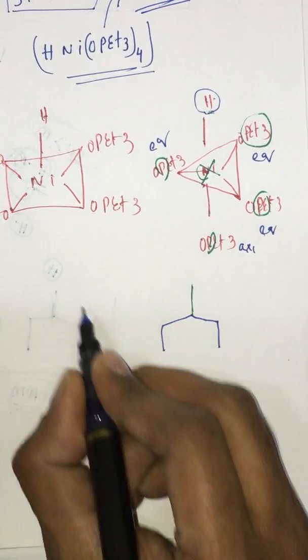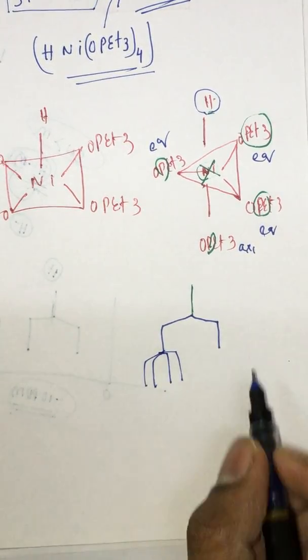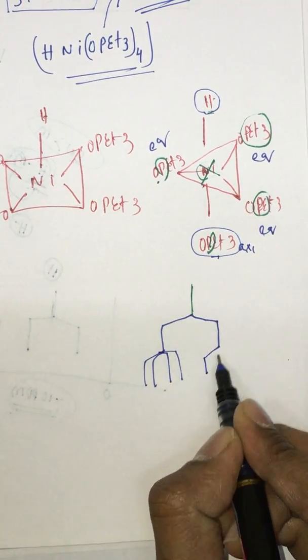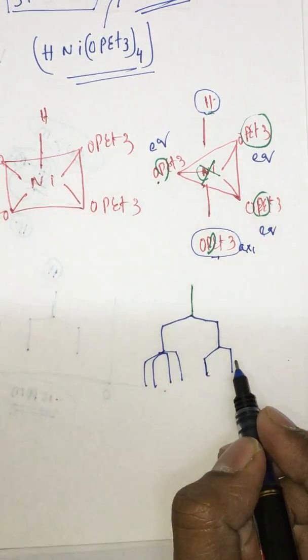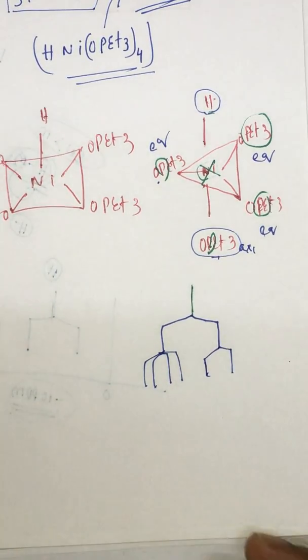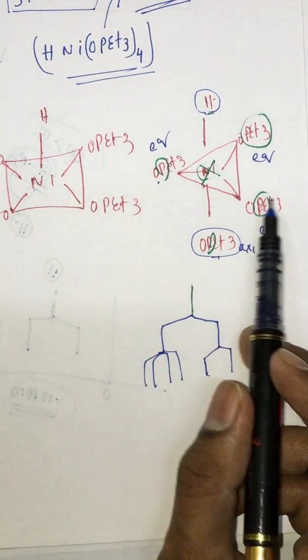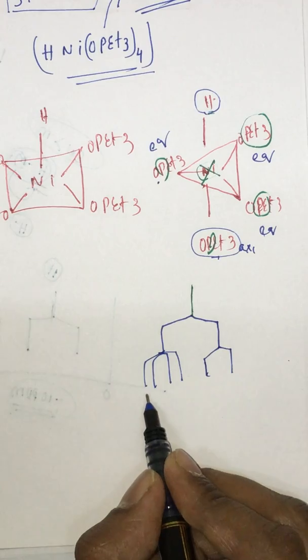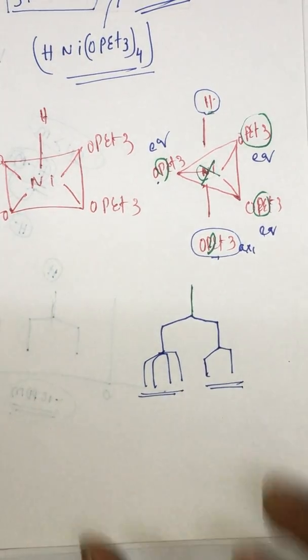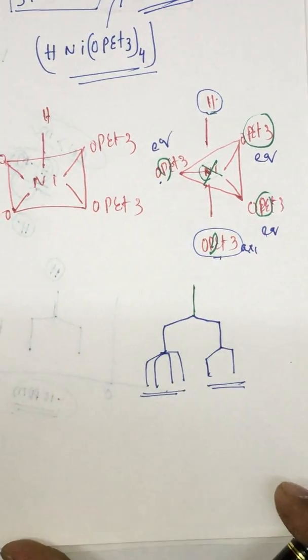Using the 2nI+1 principle, we will have a 4-line signal here, and one axial phosphorus, so that will be a doublet. So if we assume that this exists in the trigonal bipyramidal shape, it has to show one 4-line signal and one 2-line signal in the spectra, but it is not showing this. It is showing only one 5-line spectra.